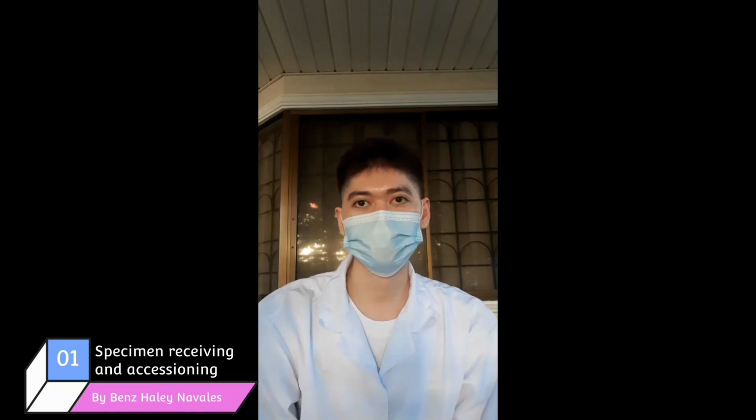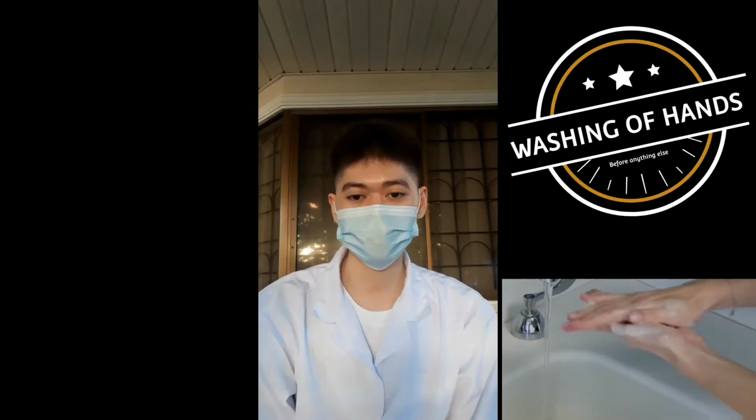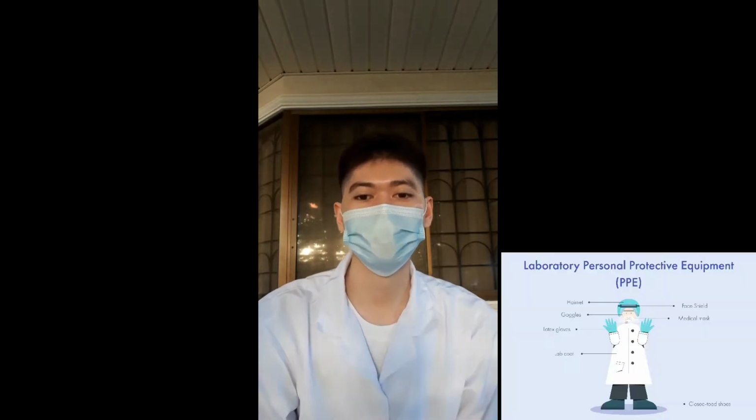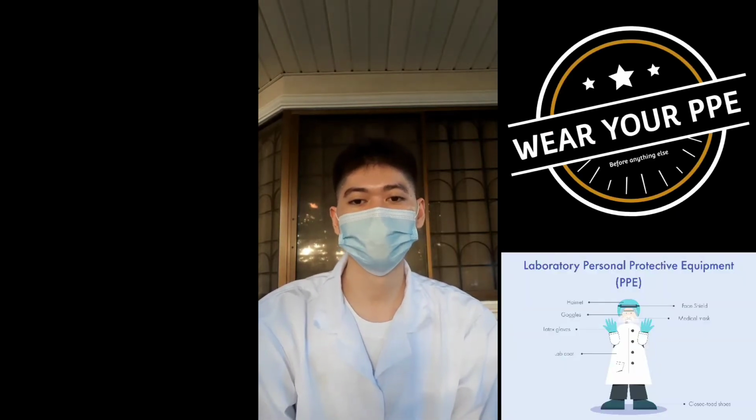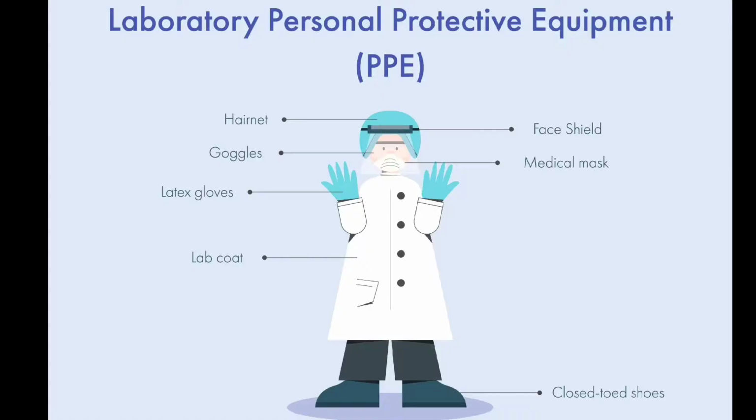Today, me and my groupmates are going to explain to you the histopathology laboratory workflow, starting from the receiving of the specimen and accessioning. So to start, we must first wash our hands to eliminate the pathogens that may be in our hands. And next is to wear our personal protective equipment or PPE, and this includes our gloves, masks, lab gowns, lab shoes, and other necessary PPEs. Especially for the girls, they need to wear a head cap because of their long hair.